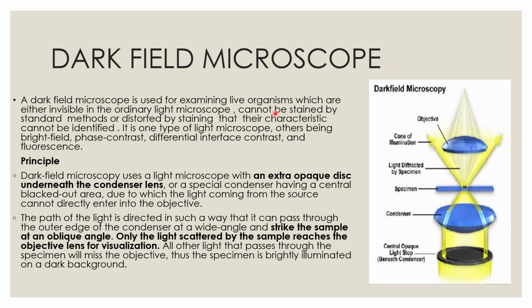There are many other types of microscope like differential interference contrast microscope, phase contrast microscope, fluorescent microscope, electron microscope. All these things we'll study one by one. But among them, one is the dark field microscope. Now moving on to the principle of the dark field microscope.